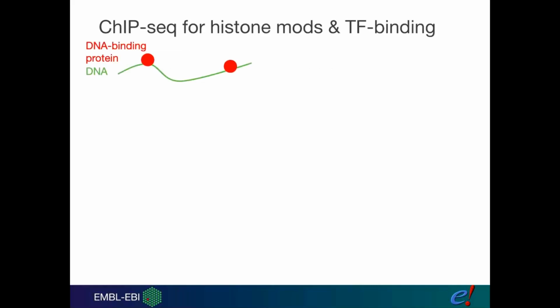So, I'm just going to quickly go over ChIP-seq as a method because it impacts on the data that we can see compared with what's actually happening biologically. Biologically, what we have is a DNA binding protein, which is bound to DNA. If it's a transcription factor, it frequently has a very small footprint, maybe 20 bases or something like that. We do cross-linking, so we introduce a covalent bond. And when I say we, I don't mean we at Ensembl. We don't do any wet science. People like ENCODE and Blueprint do this. They introduce a covalent bond that binds the DNA binding protein to the DNA.